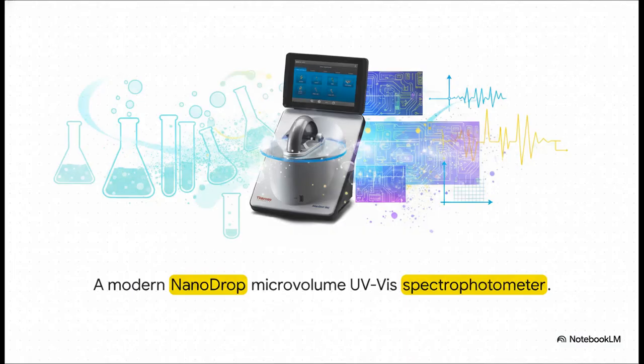Now, today, while the core wet chemistry hasn't really changed since 1951, the tools we use to read it have evolved drastically. For instance, take the modern NanoDrop 1 spectrophotometer. Instead of filling up those huge, clunky cuvettes, this machine lets you use microscopic drop volumes of your sample, and honestly, better yet, the onboard software automatically plots the standard curve, subtracts the blank for you, and calculates all the interpolations. It really is this perfect marriage of mid-century chemical brilliance and 21st century computational power.